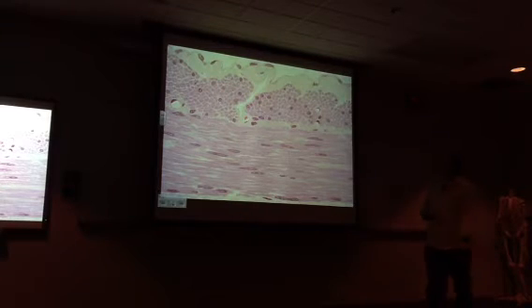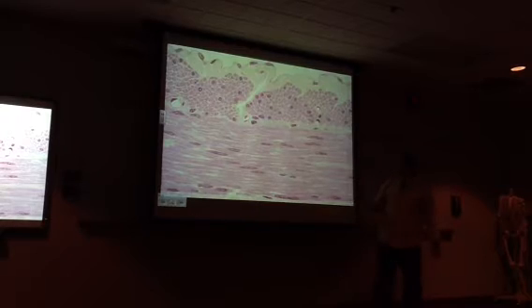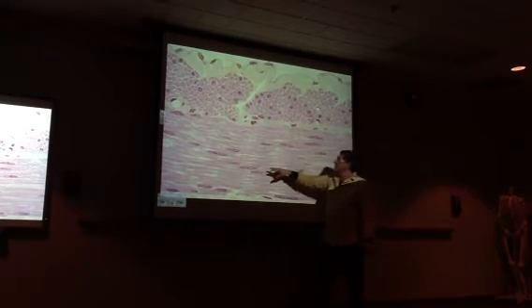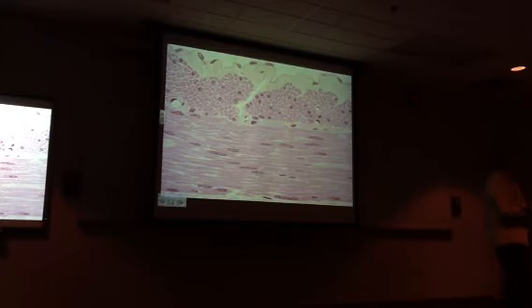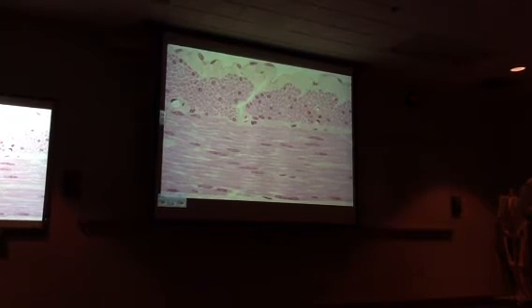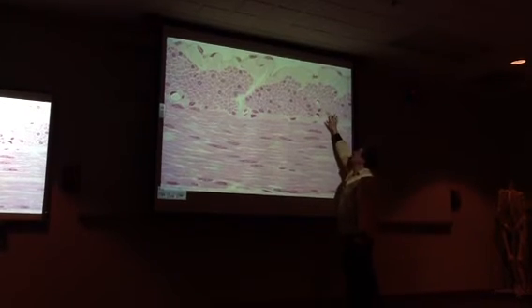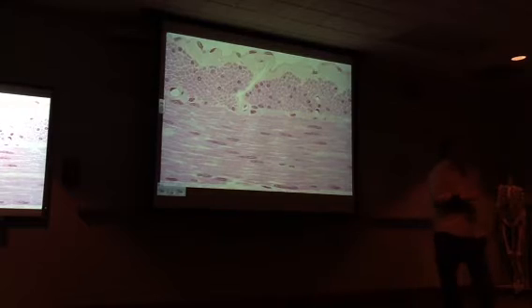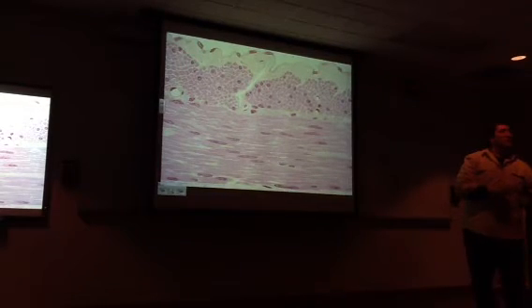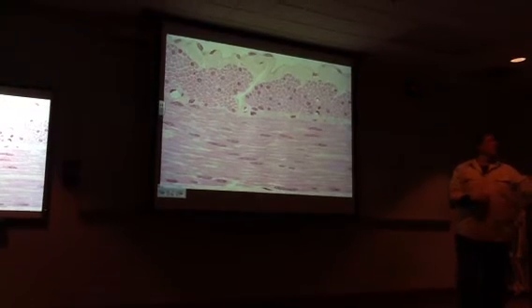All right, but once again, you can see the scrunchiness of the nuclei. You can see nucleoli suggesting the cells are metabolically active. Okay, and the other thing that I like to look at in cross-section, you can see the nuclei clearly in the middle, where the nucleus is in the plane of section. And in smooth muscle, the nucleus-cytoplasmic ratio is high. Okay, that's a useful point.